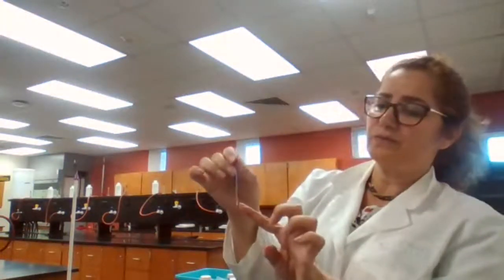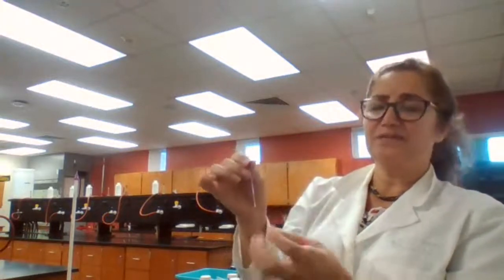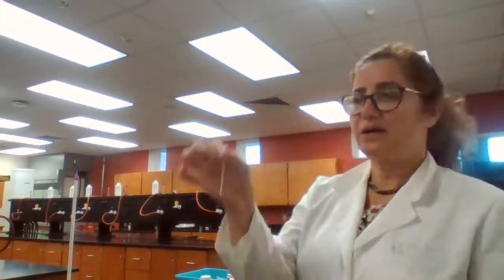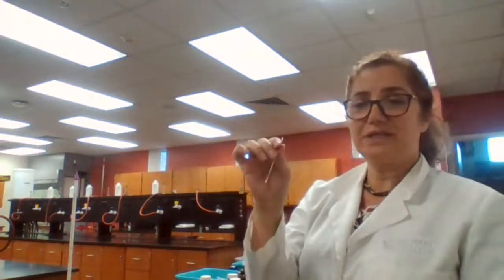That means from the time that you see part of it melt until the entire sample melts is about 2 to 3 degrees Celsius. Let's say if this compound starts melting at 78 and stops melting at 80, I have a pure sample. Or it starts melting at 79 and stops melting at 82, I have a pure sample. But if this sample starts melting at 65 and then stops melting at 79 or 76, a wide range of melting, that indicates my compound is not pure. So that's how a compound can be determined if it's pure or not using melting point. So we are looking for sharp melting for a pure sample. And if it's a wide range of melting, the sample is not pure.